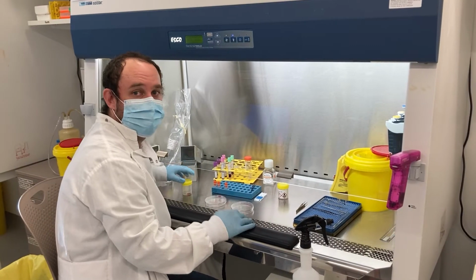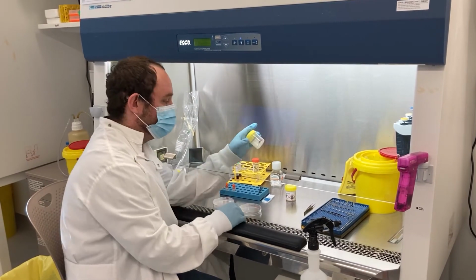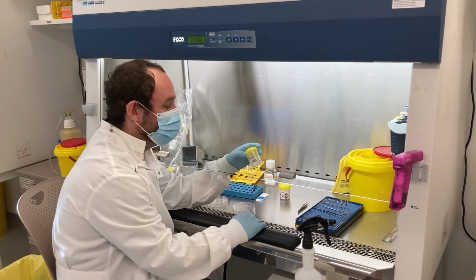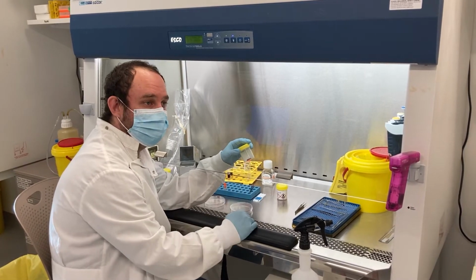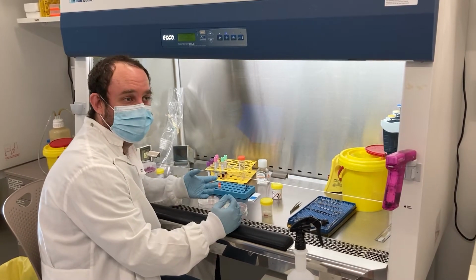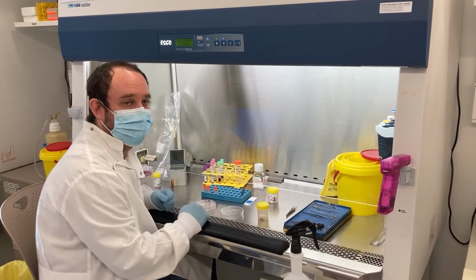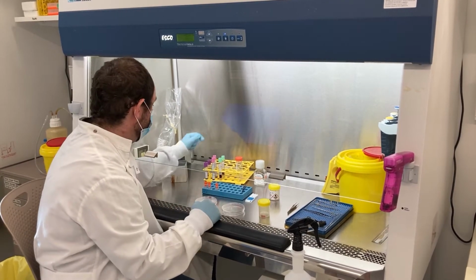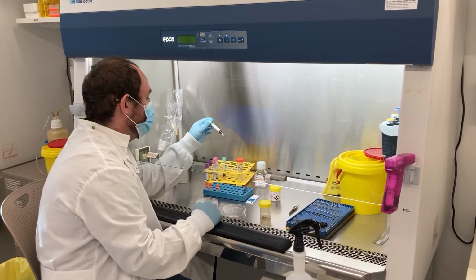Setting up the patient dissection for the clinical tissue. So we've got a bladder cancer sample here that we obtained through surgery. And the idea is that we're going to preserve it and fix it to look at histology later. We're also going to be able to take frozen chunks of the tissue and look for molecular and DNA analyses. So kind of profile the patient's molecular features, and we'll be able to look at the blood as well.